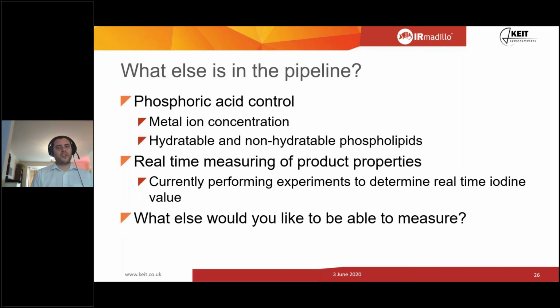So we've got some samples actually arriving from a customer very soon where we're going to start building a calibration on that. Trying to build lab samples of phospholipids and metals in oil is not even worth trying. It's too difficult to do. This is much more sensible to do with real life process samples. So we are expecting those imminently, and we will work on them and publish an application note as soon as we're able to.